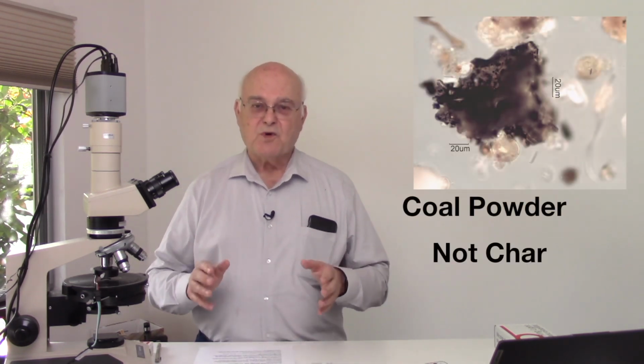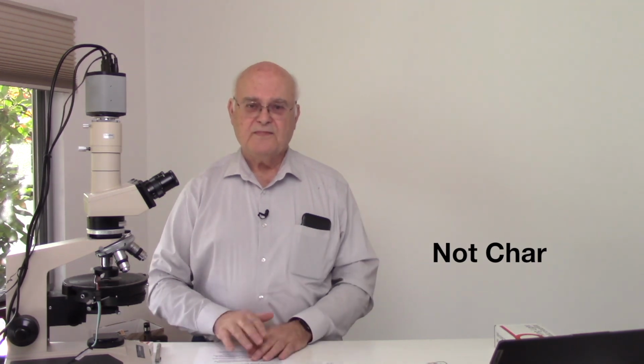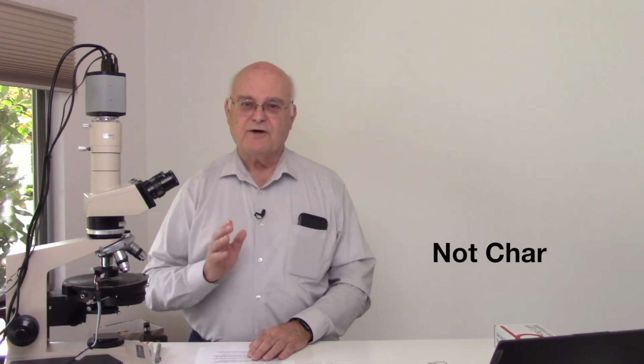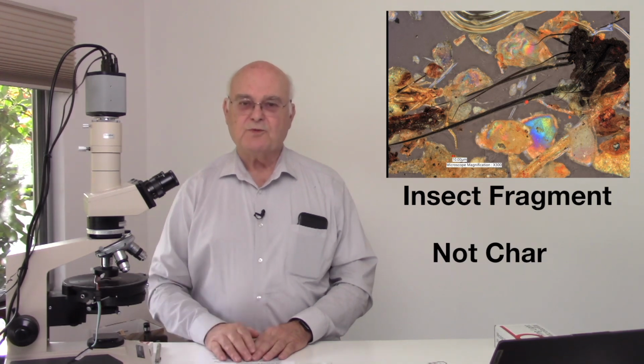They're all an important part of identifying wildfire. Identifying wildfire particles is more than just saying, I see black particles. There are all kinds of black particles. Wildfire produces a very characteristic set. And that's what we analyze when we're looking for wildfire debris.